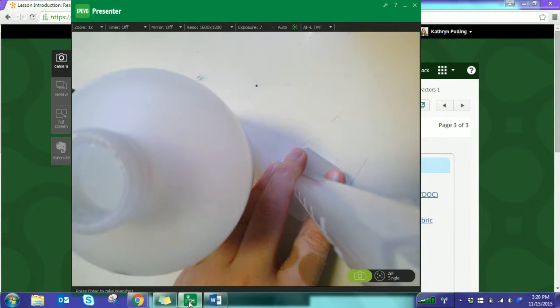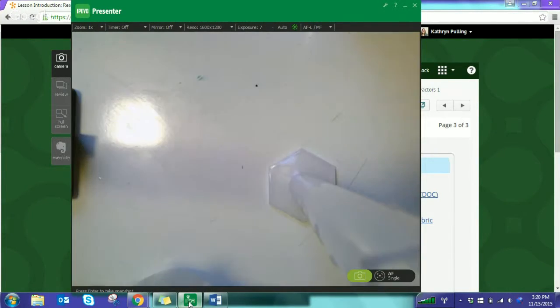One more full one. And there's 20. Okay. So I'm going to set C off to the side, and this one I don't need any water in, so I don't have to worry about adding water to anything. So now we flip in the page to 46 in the lab manual.